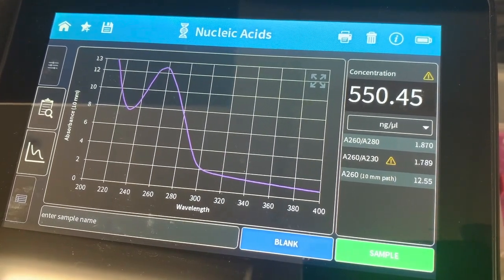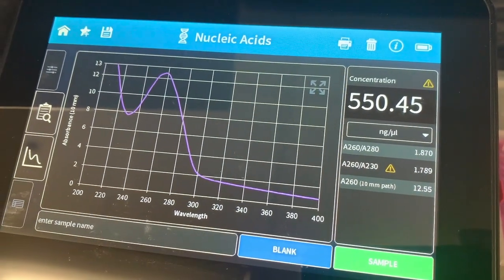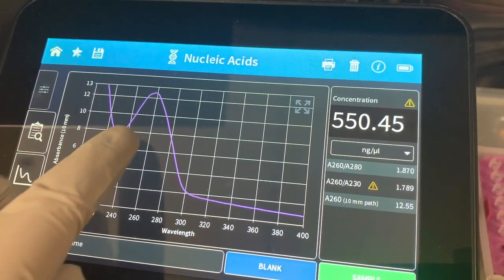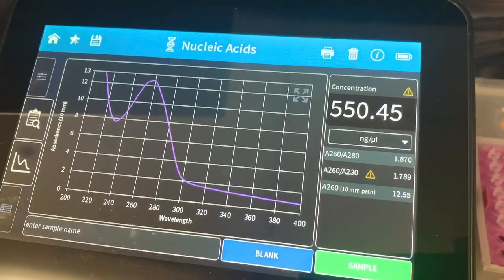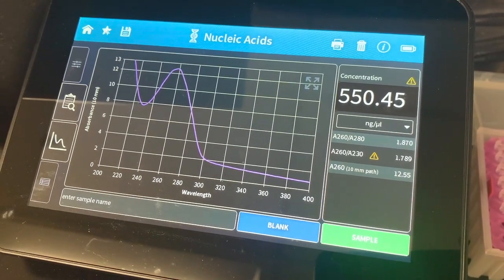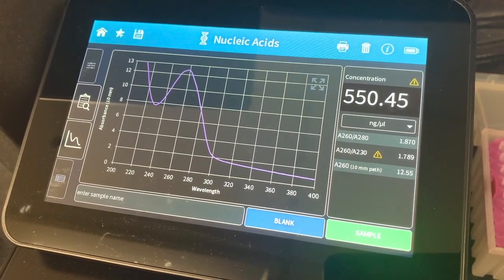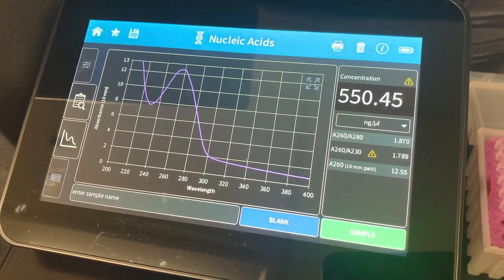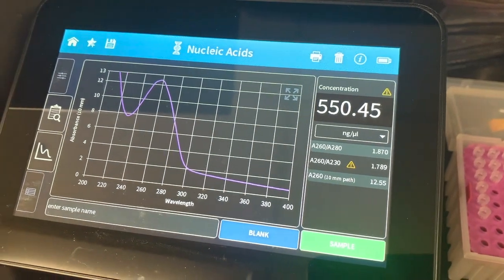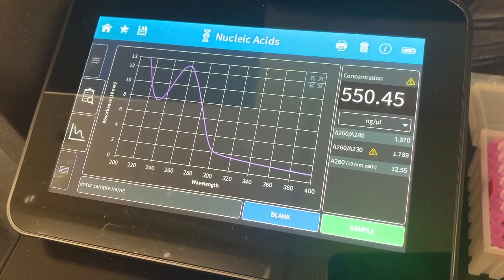So if you did a purification and one of your purity values was around 1, I would probably redo this and talk to someone about what you might do differently next time. Or likewise, if you saw that you had a peak but there was a shoulder or a second peak, you could check that out. So this for a mini prep is great. This is the concentration I would use to determine how much of this mini prep to send for sequencing or use for other applications. If you were using this for RNA, some of these values would be different and would have different meaning. This is something you could talk to someone about if you want to use it for RNA quantification.